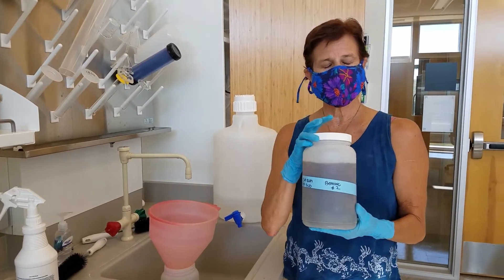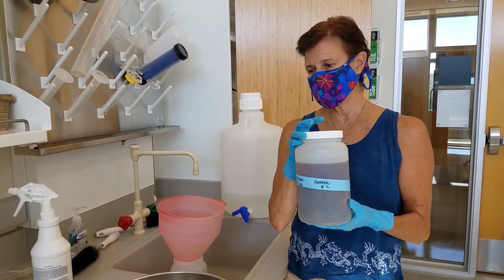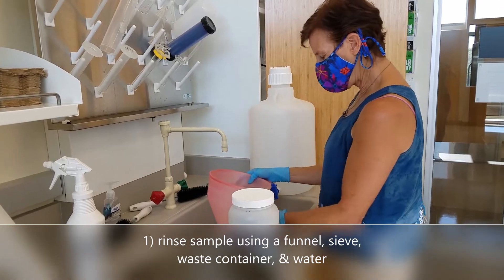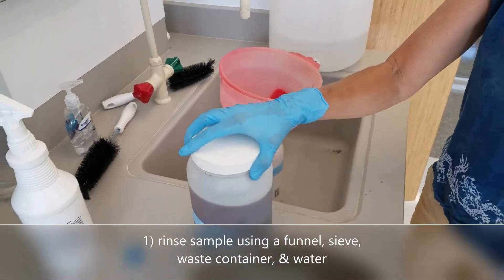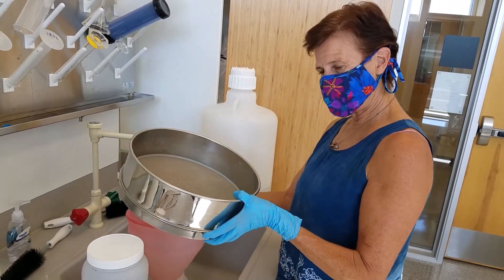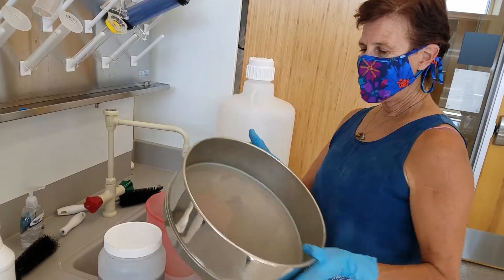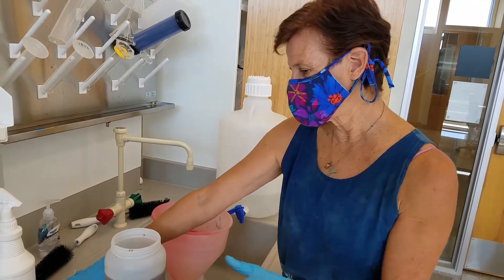If you remember, we preserved it in an ethanol solution, so the first step is to rinse it. We've got a waste container for the ethanol and a large funnel. This is sort of a two-person operation since we've got such a big bottle, so we'll basically sieve it and rinse all the ethanol off, and then we'll put it into a smaller container.